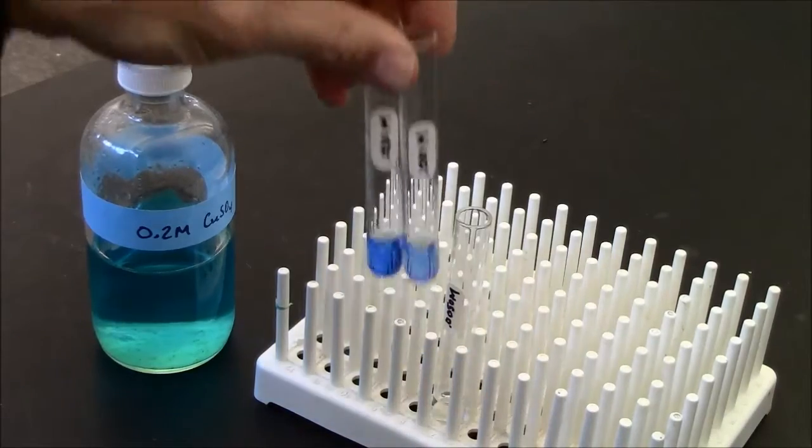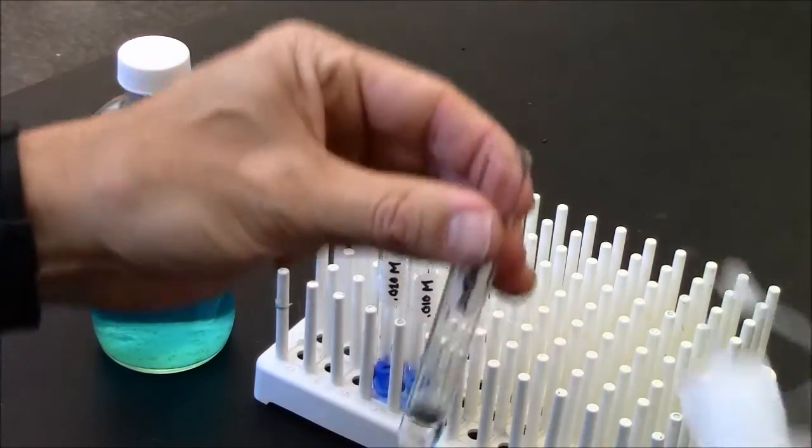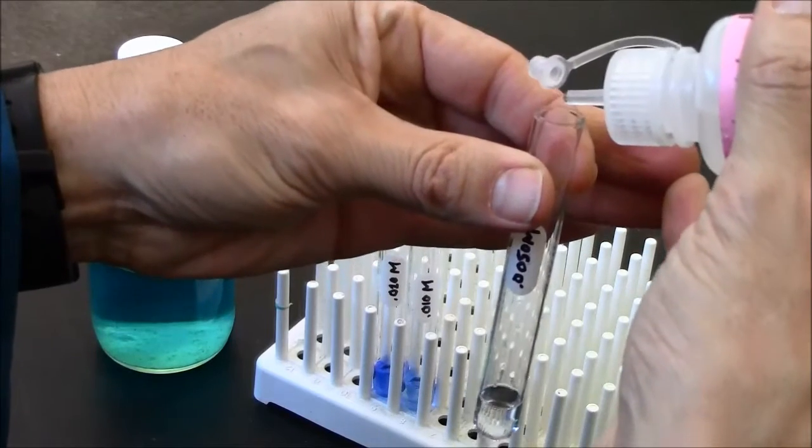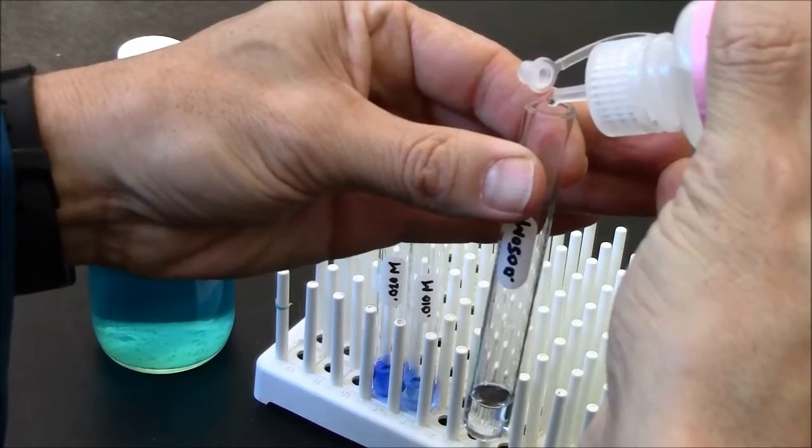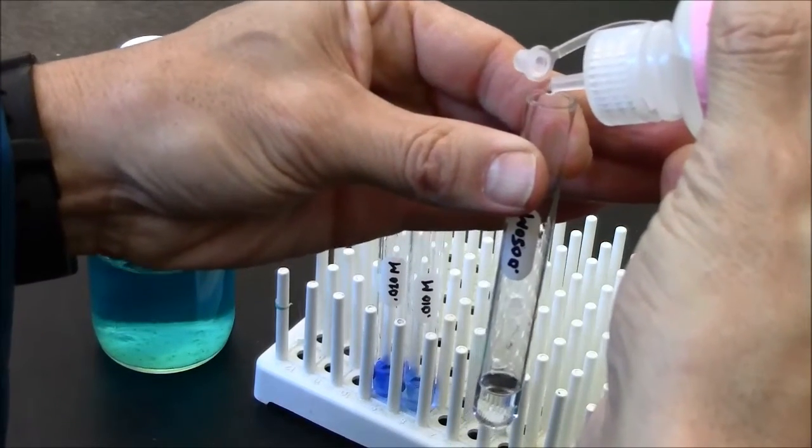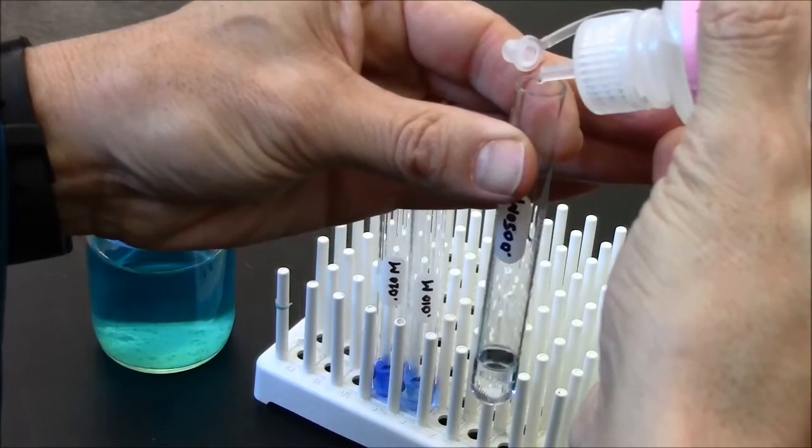So this is a test you can use. You can use ammonia to determine whether your solution, which may appear colorless, in fact does contain copper ions.